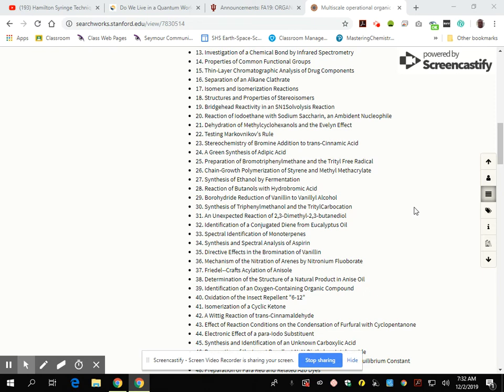And you may have to take a photo. I don't know if we're going to be able to hook these up to printers. You may have to take a photo of your spectrum. The only thing I can tell you about the spectrum is you may not get a peak that comes out exactly. It may be over a broad region. And if that was the case, I would look for your answer.